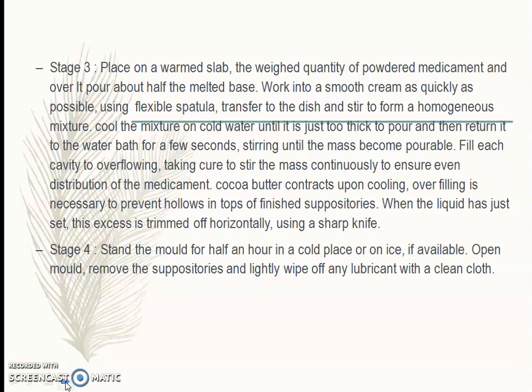Cocoa butter contracts upon cooling. Overfilling is necessary to prevent holes or drops in the finished suppository. When the liquid has just set, the excess is trimmed off horizontally using a sharp knife. Stage 4: stand the mold for half an hour in a cold place or on ice. If available, open the mold, remove the suppositories, and lightly wipe off any lubricant with a clean cloth.